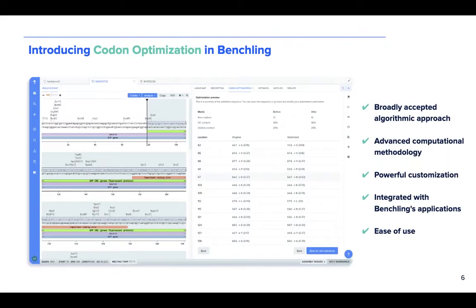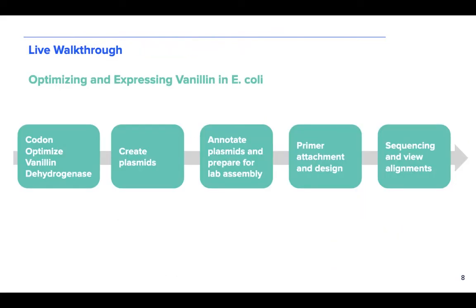So without further ado, I'm just going to come back through here. What we're going to do is I'm actually going to start and show you how to import sequences in bulk into Benchling. It won't require any action on your end. Then you can go ahead and sign into benchtalk1.benchling.com following the login credentials you set up the other day.